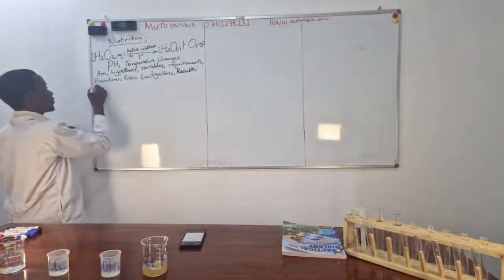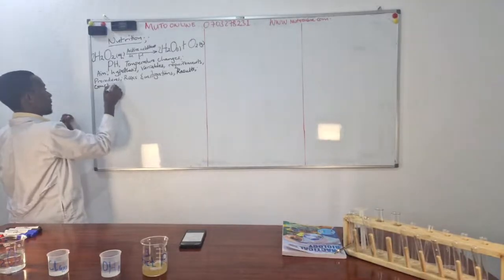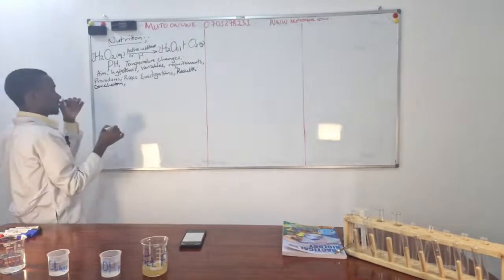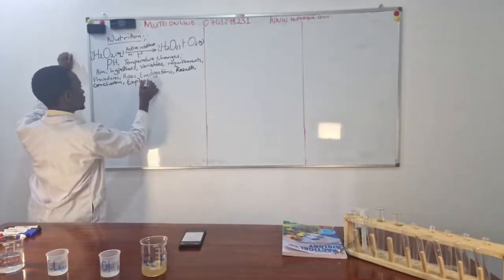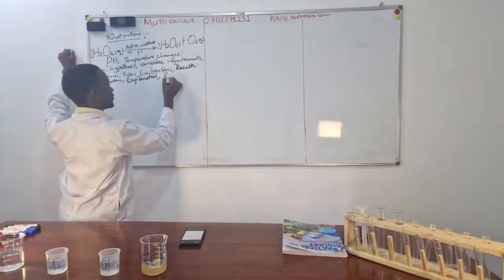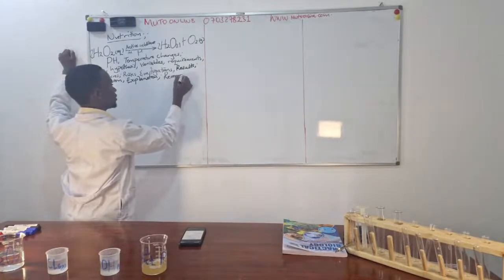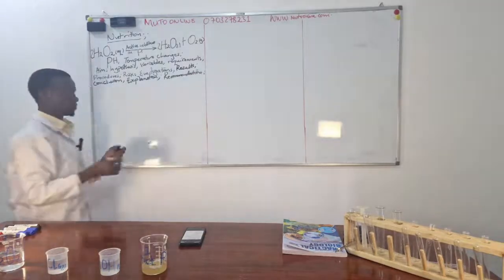We have to give a conclusion based on results, an explanation of the results, and finally give a recommendation based on the explanation made.